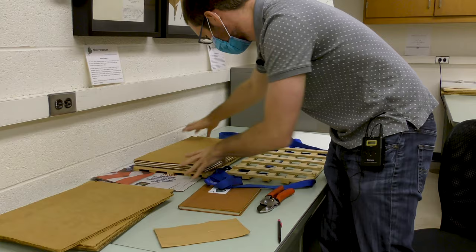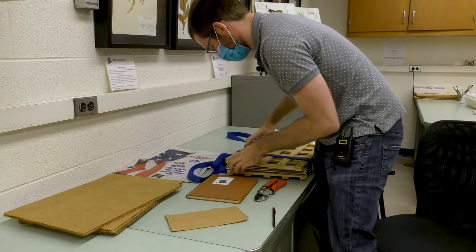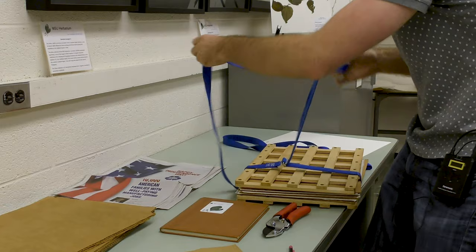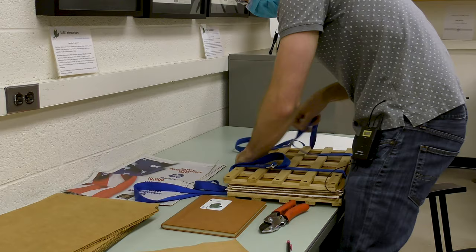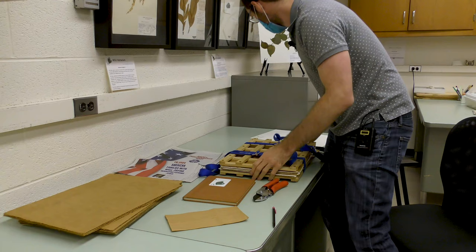You put it back together in the field — they're pretty durable, low tech, but they do their job really well. Once you have your plants in here you can tighten it right up. This entire press can go into the freezer or into the drying oven and then you can use it again. You can put up to around 30 specimens in here, and when you tighten it up in the field you can kneel on it or even stand on it because you really want to squish those plants down.